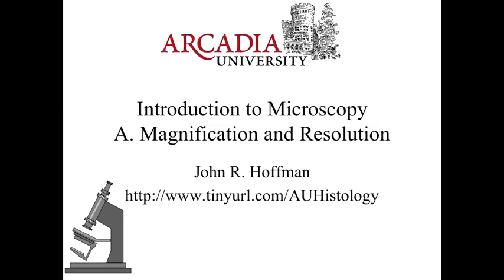In this first lecture, we're going to take a look at Introduction to Microscopy. And in the first portion of this lecture, we're going to look at some basic properties associated with microscopy, namely that of magnification and resolution.